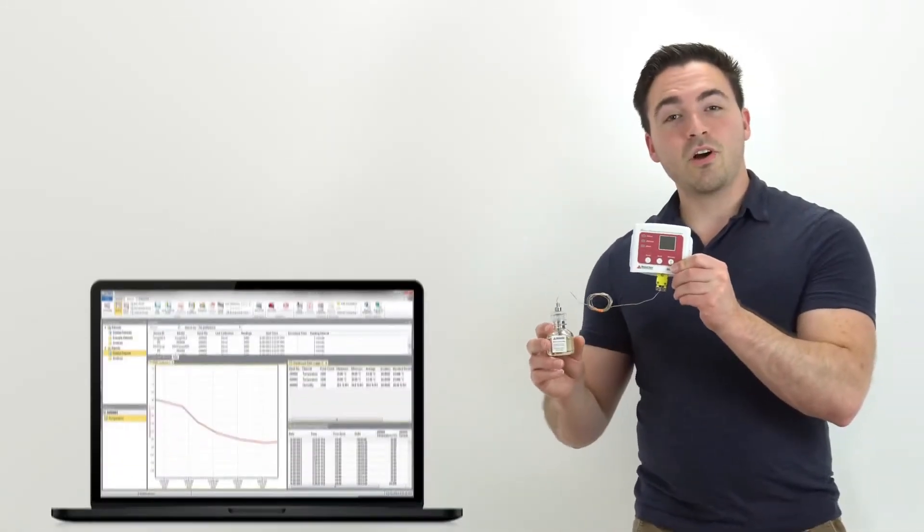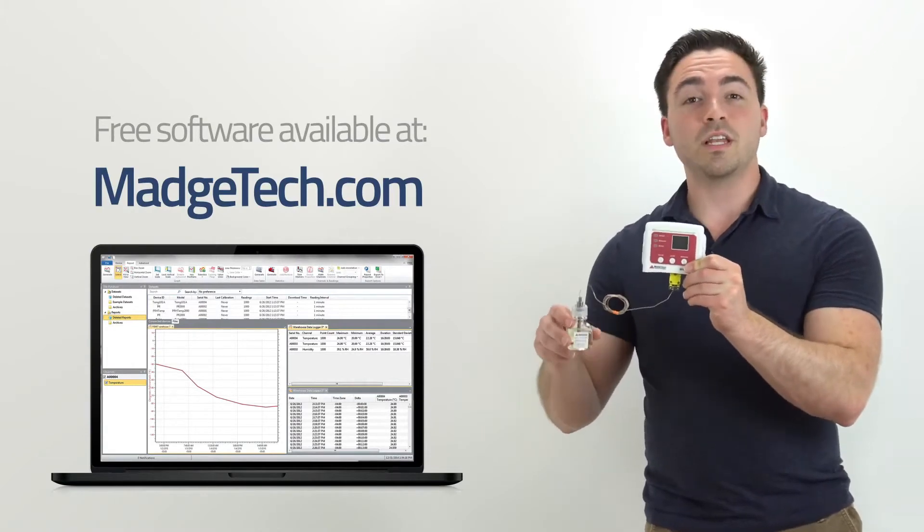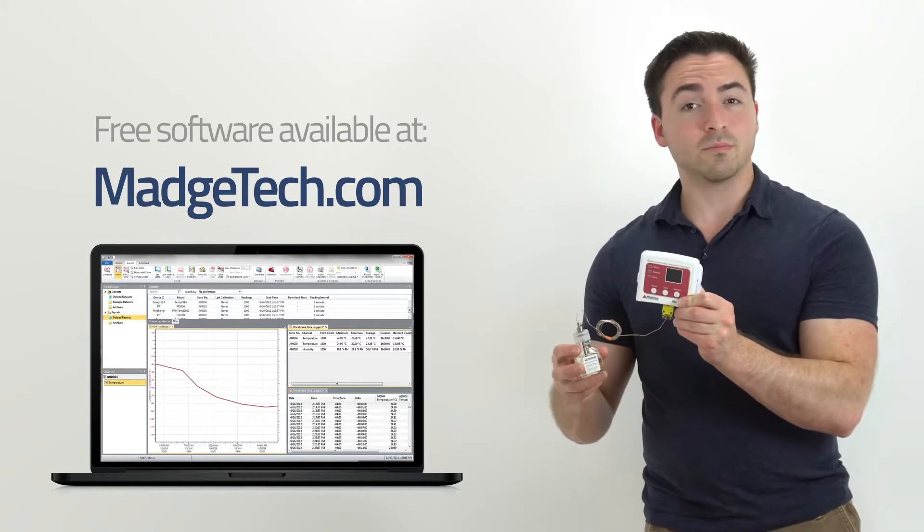By using the Magtech software which can be downloaded for free from magtech.com, users can analyze recorded data in graph view, tabular view or as summarized statistics.